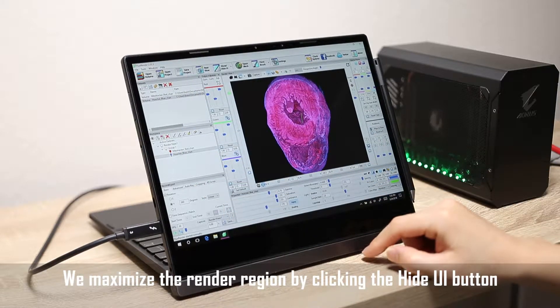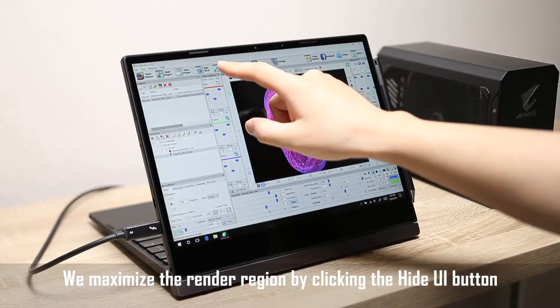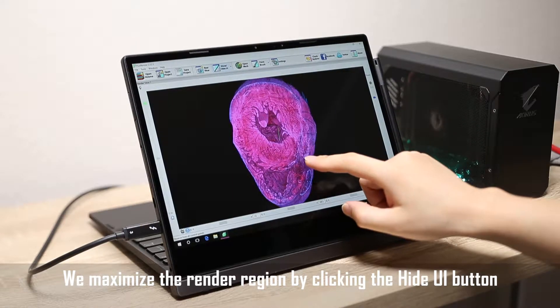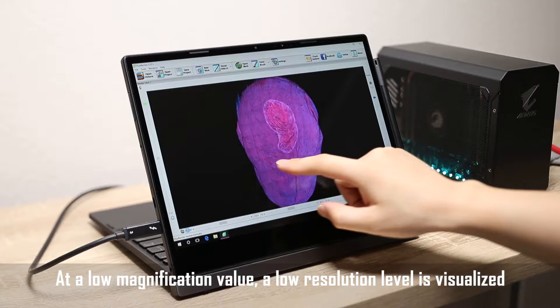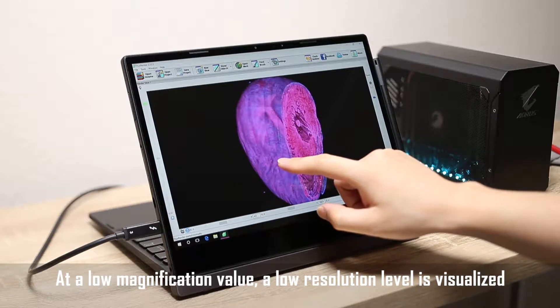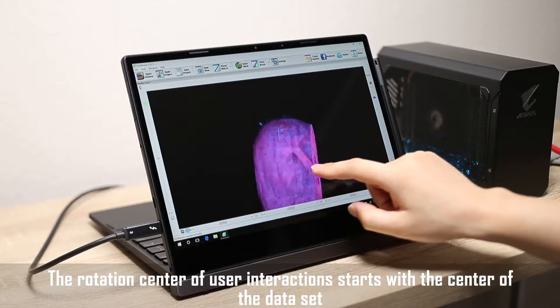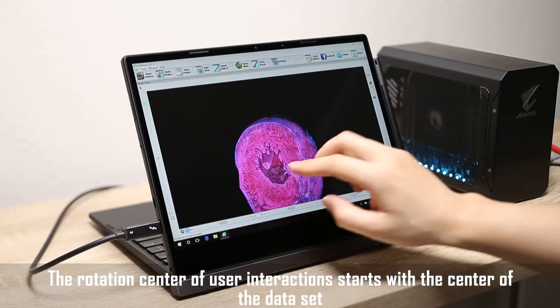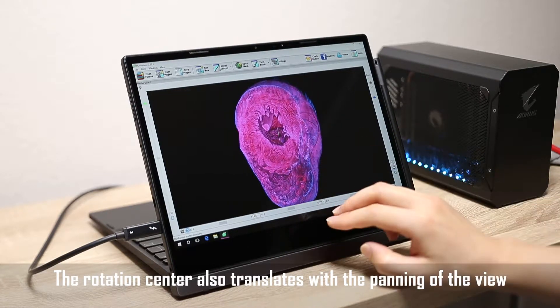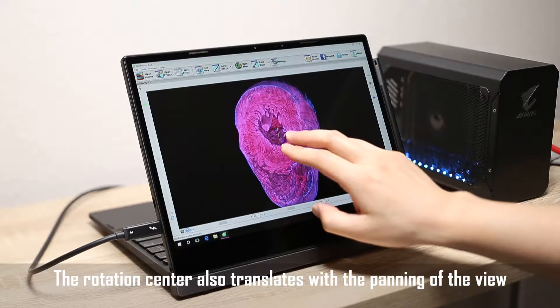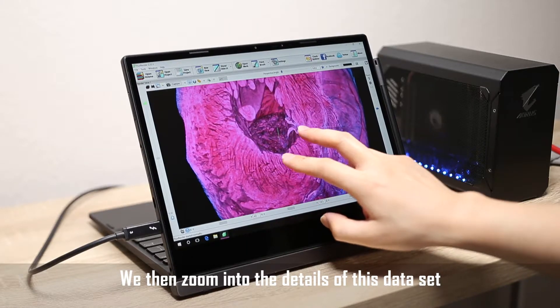We maximize the render region by clicking the Hide UI button. At a low magnification value, a low resolution level is visualized. The rotation center of user interaction starts with the center of the data set, and also translates with the panning of the view.